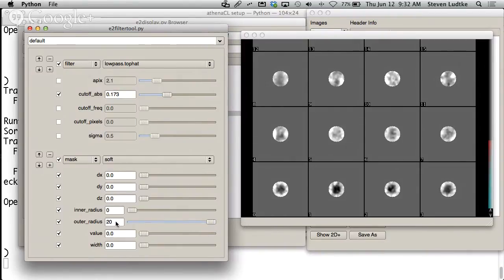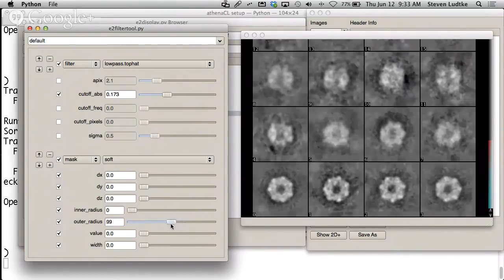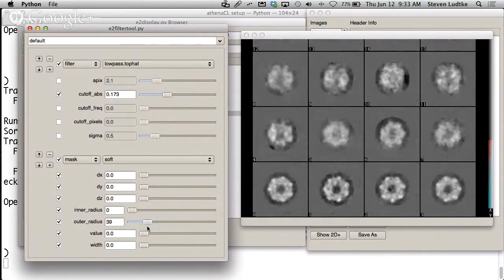What if now I wanted the maximum to be back to 5 again? How would I reduce the range? Well, these value sliders, as they're called, are set up so you can actually specify greater than or less than values in the box. So if I say less than 5 here, it'll readjust the maximum of the slider, so the maximum value will be 5 again. If I say less than 200, now I can adjust the mask out to fairly high radii. So I can interactively play with my mask parameters.